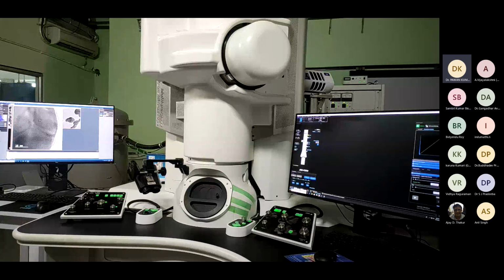Okay, sir. So basically, even for shutdown, probably more experiments would be done. The vacuum is anyway maintained 24/7 inside the column. But there are some basic things related to how to remove the sample and how to park the system.